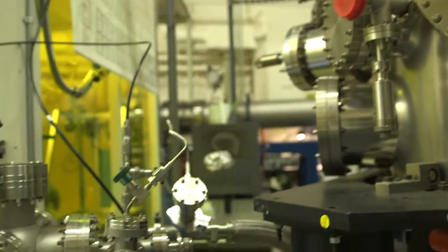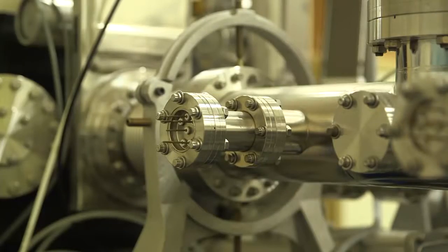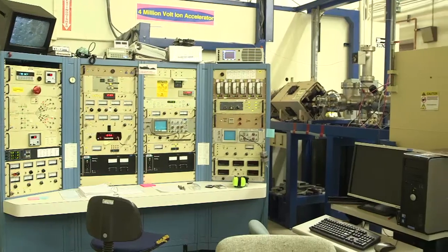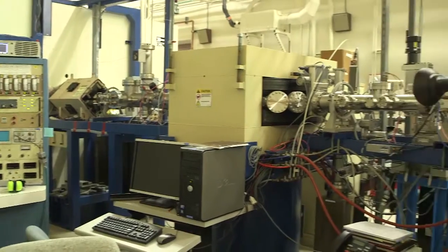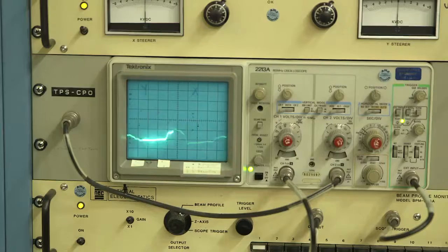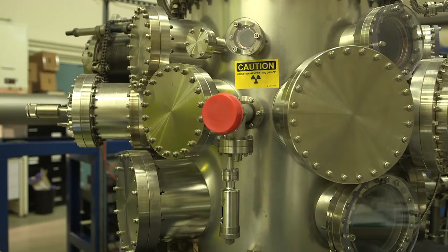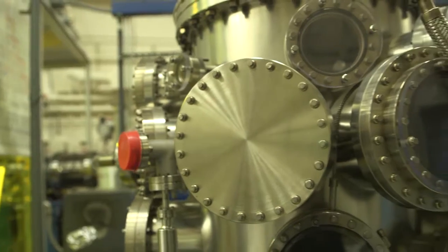Most of our research for nanoporous materials is related to laser targets. We have adapted the ion beam analysis method that is routinely used in many laboratories around the planet, and specifically adapted it for low-density nanoporous materials.